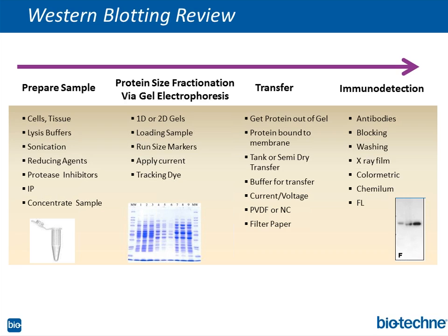Well, think about it. The protein is buried in that matrix of gel, and it's really about epitope access and steric hindrance, and that's the whole reason why people transferred the protein from the gel to the membrane: to open up access to the epitopes and apply antibodies. And of course, once you've done the transfer, we can do tank transfer and semi-dry transfer, and there are some fast transfer systems out there.